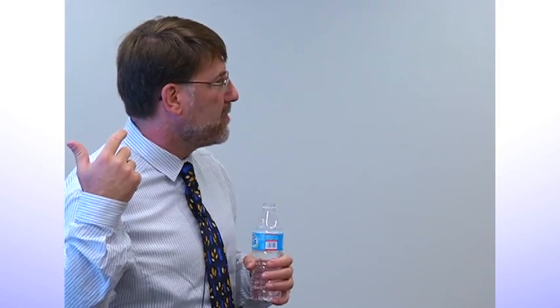Is it true that the MiSeq is lower in the amount of reads? Yes, 6 million reads versus 200 million per sample. So it's typically used in different experimental designs. It's not usually used for RNA-seq.